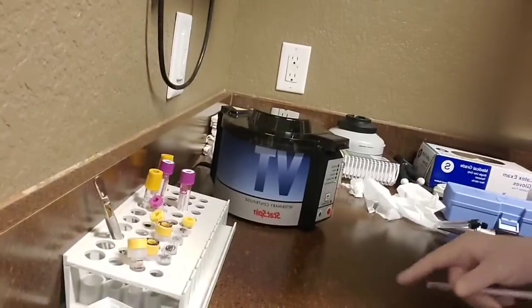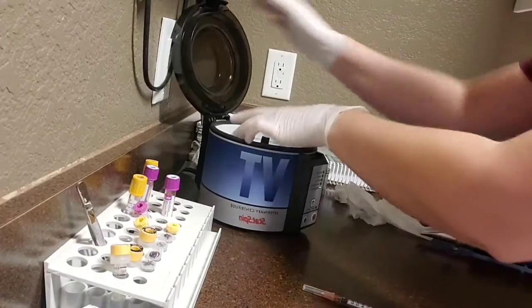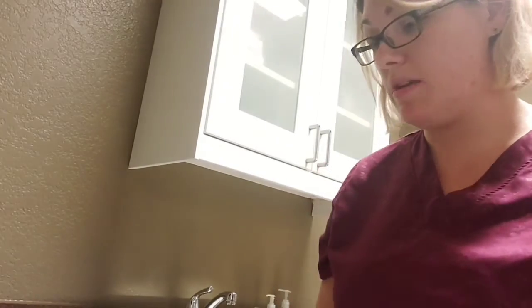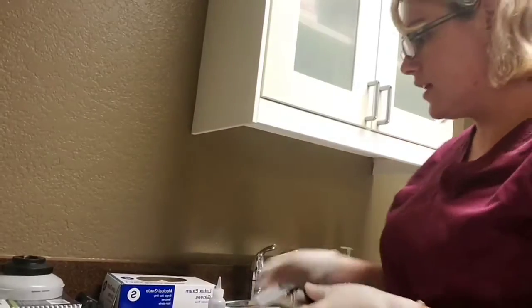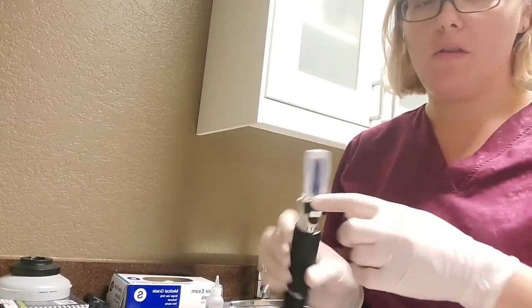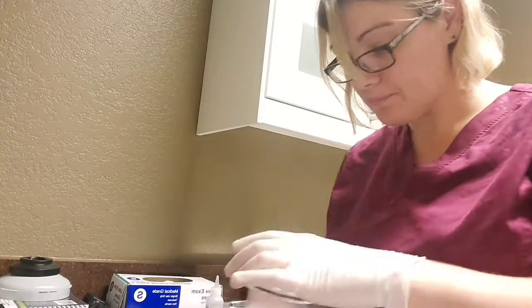All right, so we are just now finishing up here. We'll take this out and come back around to me here. One of the things that I didn't mention is you do want to make sure that you clean your refractometer in between. You don't want to get any false readings. I did that with a little bit of distilled water and some Kimtech paper, just rinsed it off so that I no longer have any other sample in there to contaminate it or give me false readings.